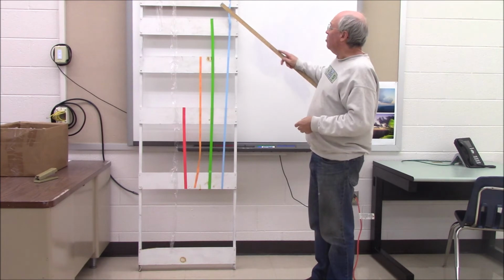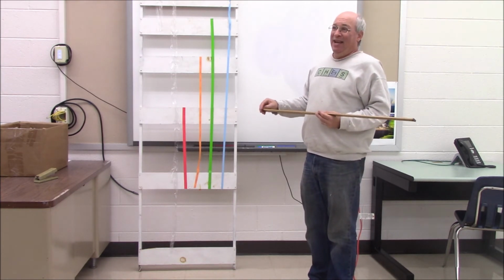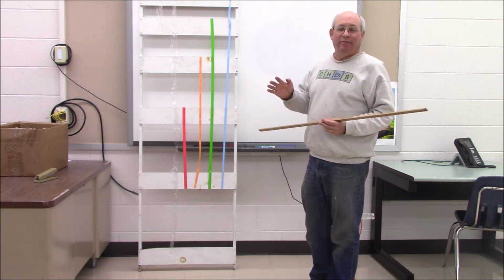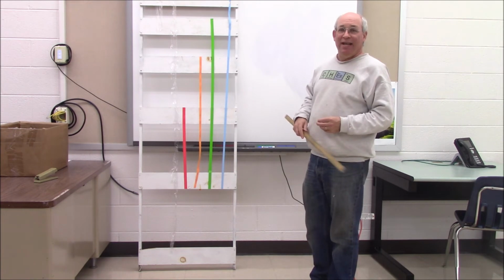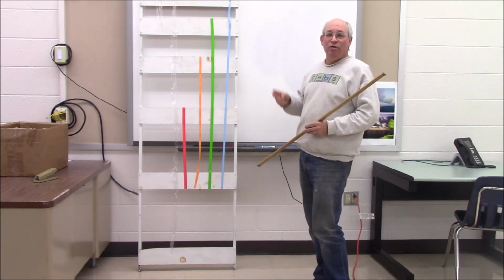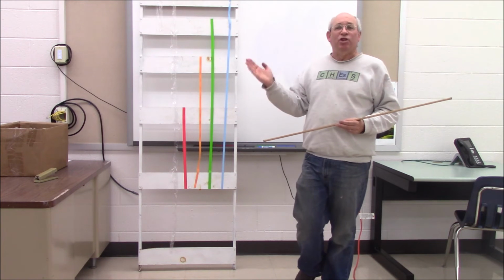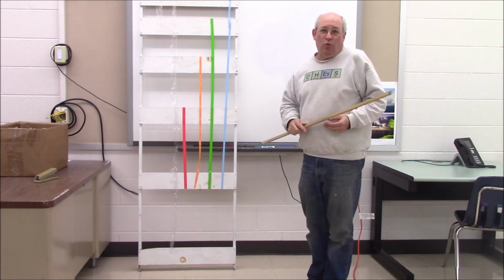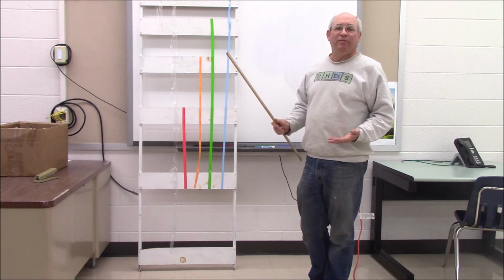When those electrons are energized and are at higher energy levels, they, quote, don't want to be there. They come back to their ground state. And when they do, they give off or emit that energy. And if you think about the electromagnetic spectrum, there's a whole range of energies. What we did was we dealt with energies that were in the visible spectrum, Roy G. Biv.